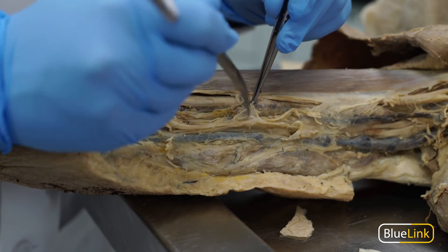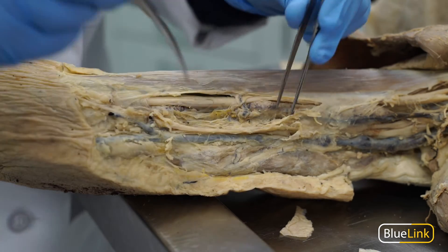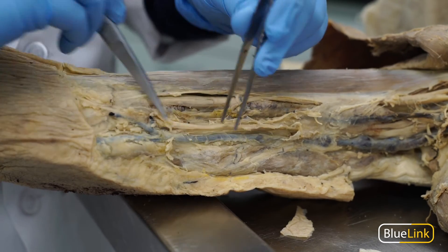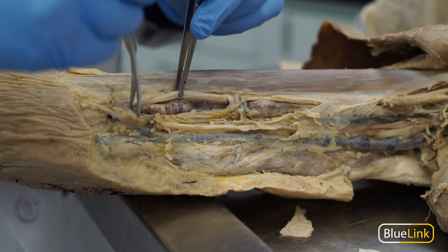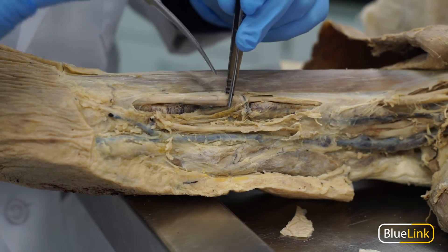Blunt dissection is always used to clean arteries, nerves, and veins. A probe, forceps, or the closed tips of scissors can be used to scrape fat and fascia off of the neurovasculature bundle. You can also use the dull edges of the scissor blades to poke and spread throughout that fascia.